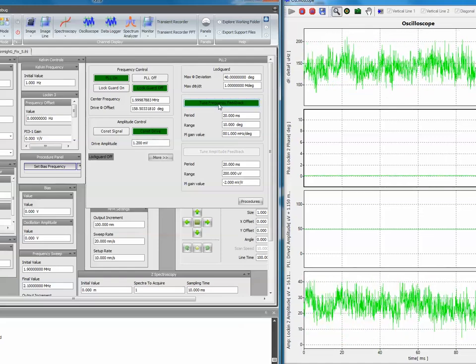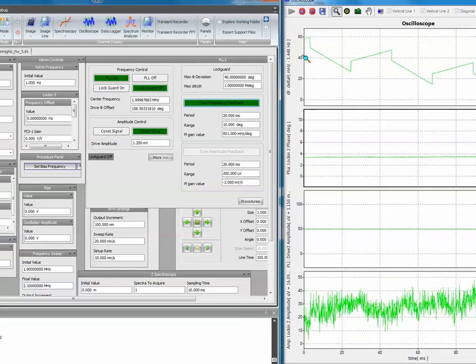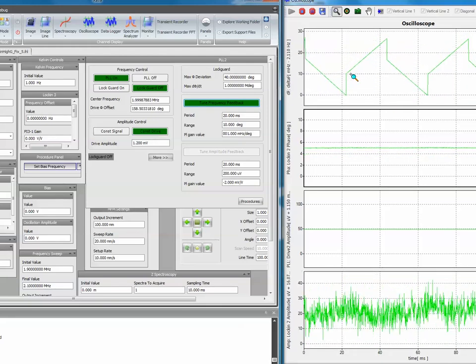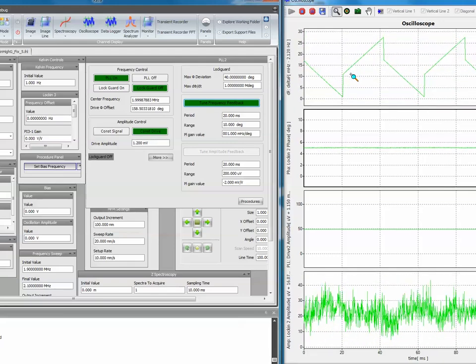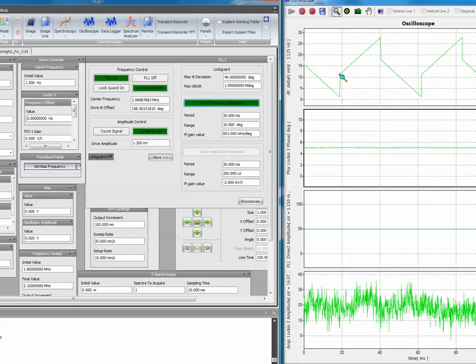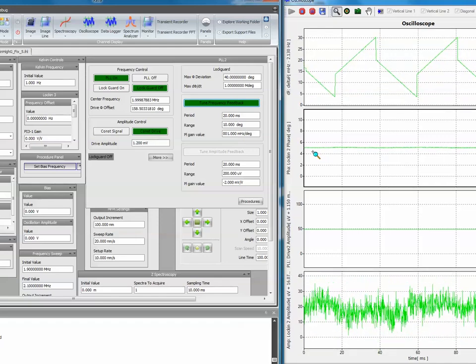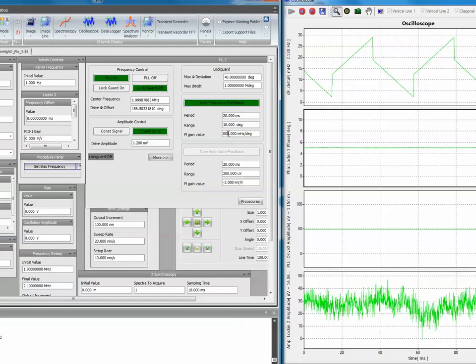If we now switch on the frequency tune, you first see how the delta F creeps to the new average value, which is somewhere around 5 hertz, because half of the time we're at 0 hertz and half of the time we're at 10 hertz. And we get this pattern. And this pattern is basically the proportional gain and the integral gain hops when the set point hops up and down. You don't see anything on the phase yet because our gain is way, way too low.